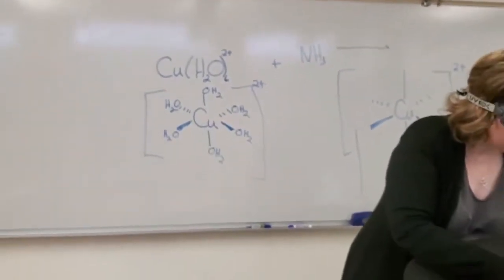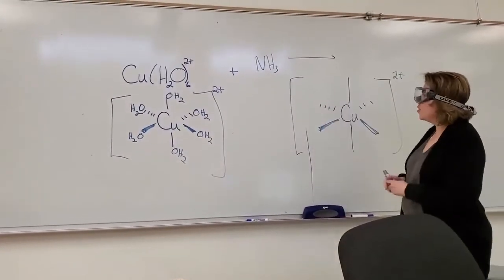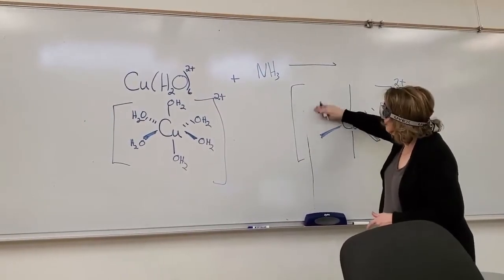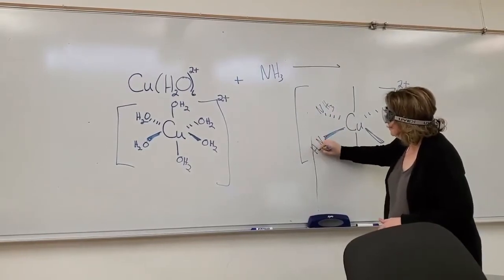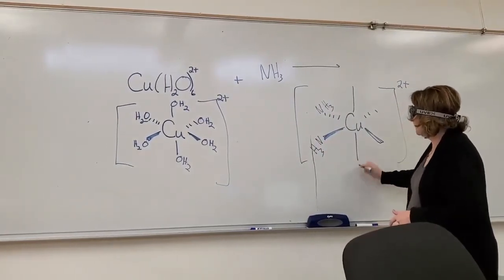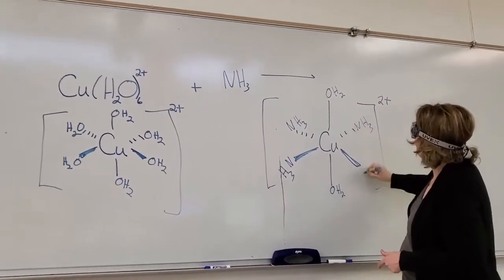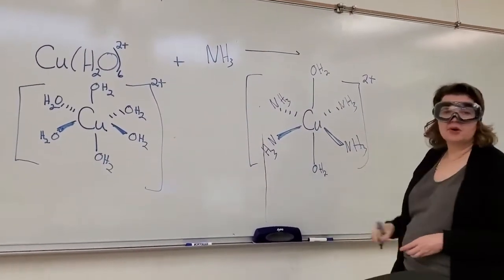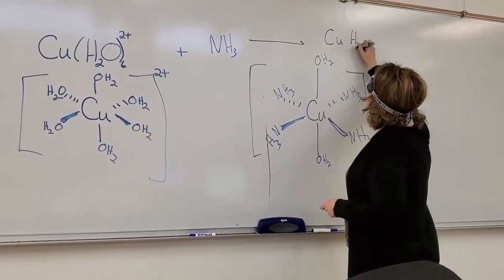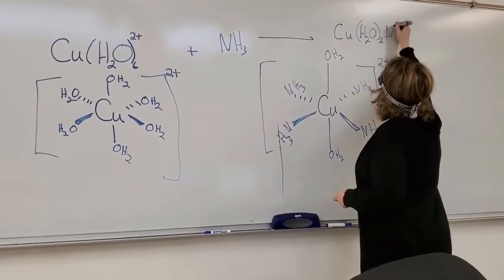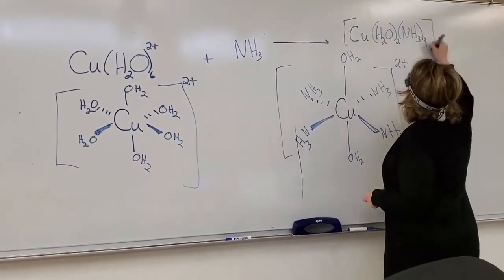Let's talk about what that chemistry is here. As I add the ammonia, four of the waters, eventually if I add enough, four of the waters will be displaced with ammonias. The axial positions are going to stay as water. Those axial positions are extra sticky with those waters. So this is that deep cobalt blue. Here is my complex ion. I still have two waters, and I have four of the ammonia groups. Still a plus two charge.